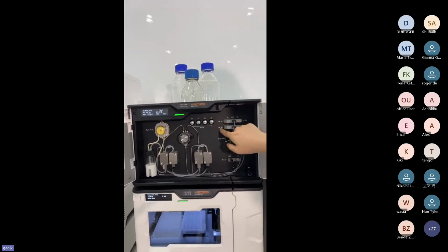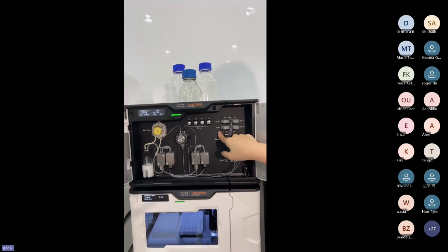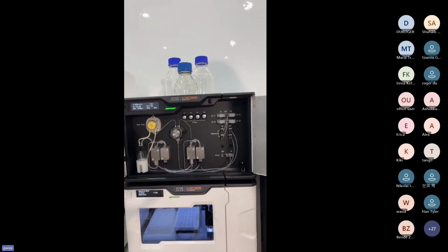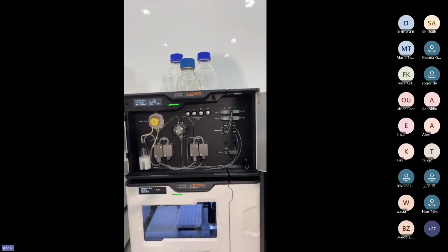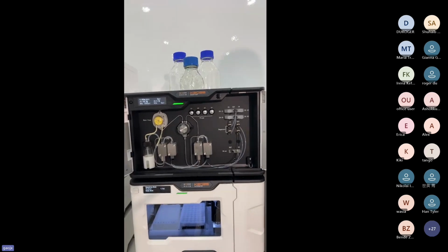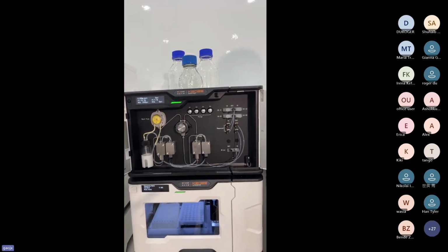Users can use 2 channels, A1, B1, for sample analysis, and after the analysis is completed, they can switch to other channels, A2, B2, for system flushing or use another analysis method. Users can set up this in the workstation.